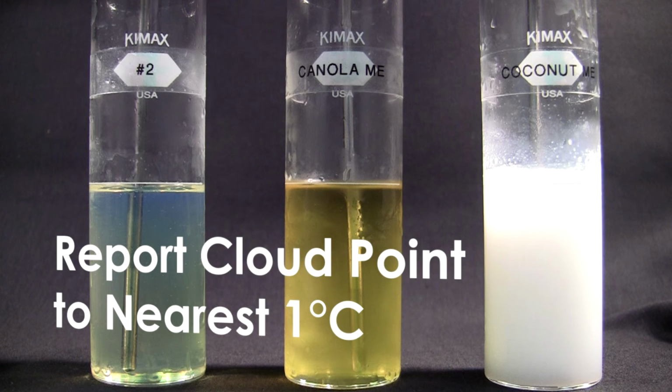Report the cloud point to the nearest 1 degree centigrade at which any cloud is observed at the bottom of the test jar, which is confirmed by continued cooling.